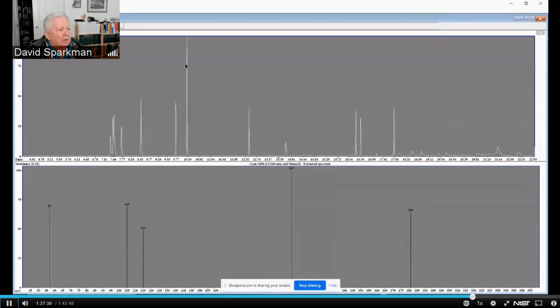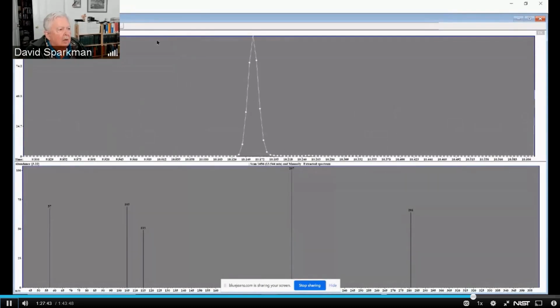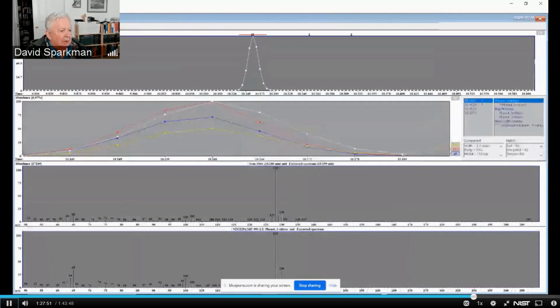And now I'm going to let AMDIS do this, and I'm using a library here. Let's open this up a little more.